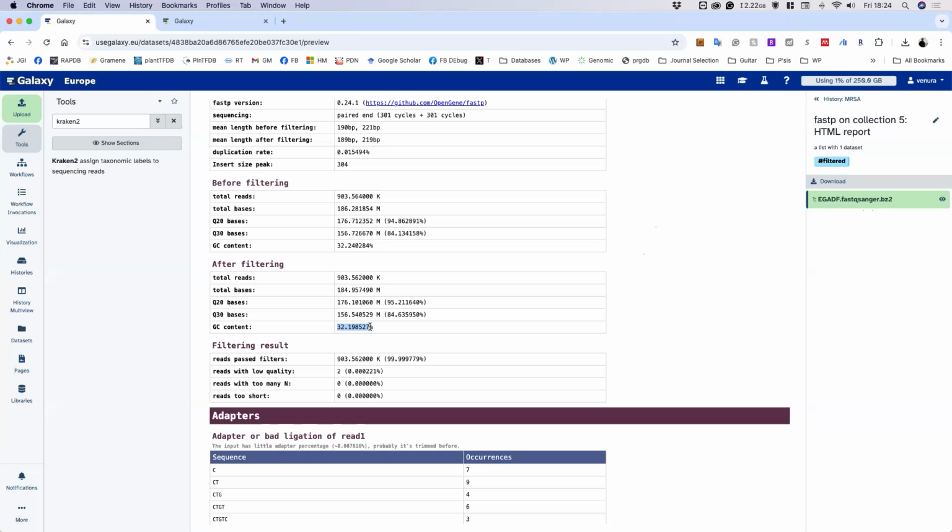So normally we are analyzing means using the mean separating method. In that case, you ask whether there's a significant difference or not. So that's why I asked. Yes or no? We have to be clear. Yeah, I get your point. I didn't expect to go that deep. It's not even changing by 1%. So based on that, it's an approximation. But don't worry about mean separation, don't think that hardcore. This is a very simple exercise. Don't worry, there will be no negative marks.